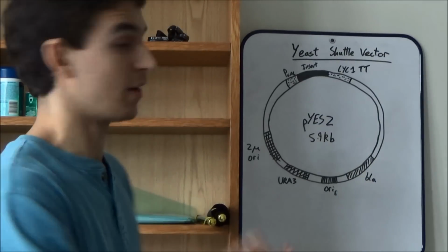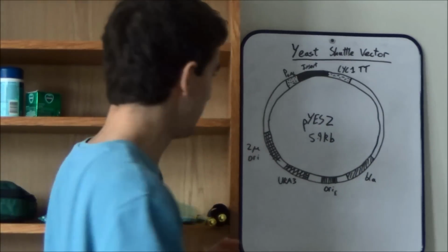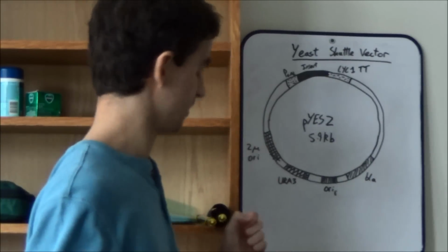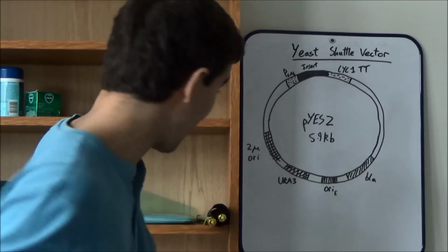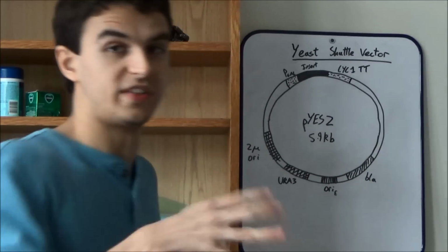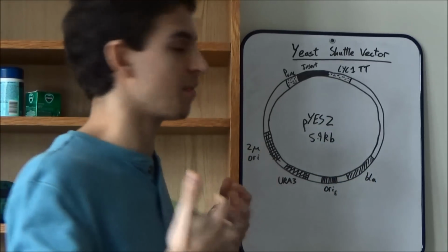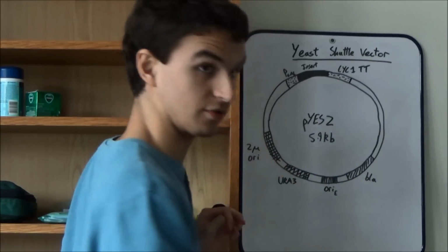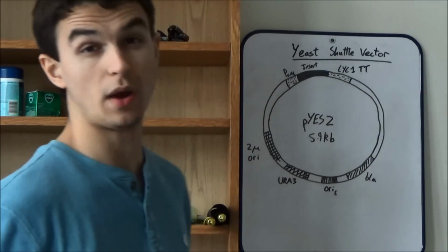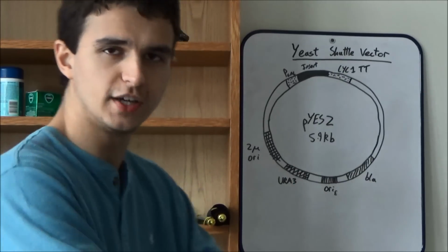Now the thing about using a shuttle vector is that they aren't as stable, as you may imagine, within the yeast cells as the integrative vector. So therefore you must always be adding the selection pressure of a minimal medium without uracil. So that way only cells which have taken up the plasmid can actually produce uracil. Now the one thing we missed out is this bit here, the polylinker, where we insert our DNA. Because after all, that's what we're doing this for in the first place.